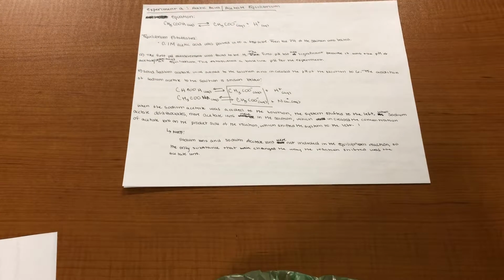Equilibrium was established by adding 0.1 molar of acetic acid into a test tube, and then the pH of the solution was tested. The first pH measurement was found to be 4. The first pH test was significant because it was the pH of the acetic acid and acetate at equilibrium. This established a baseline pH for the experiment.